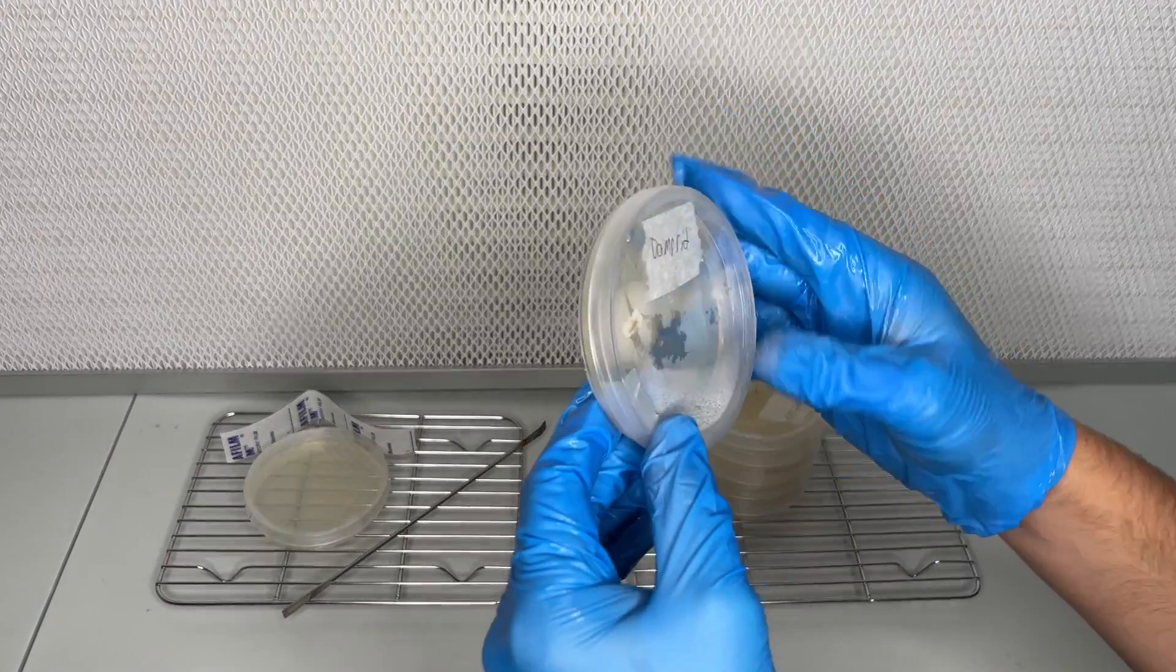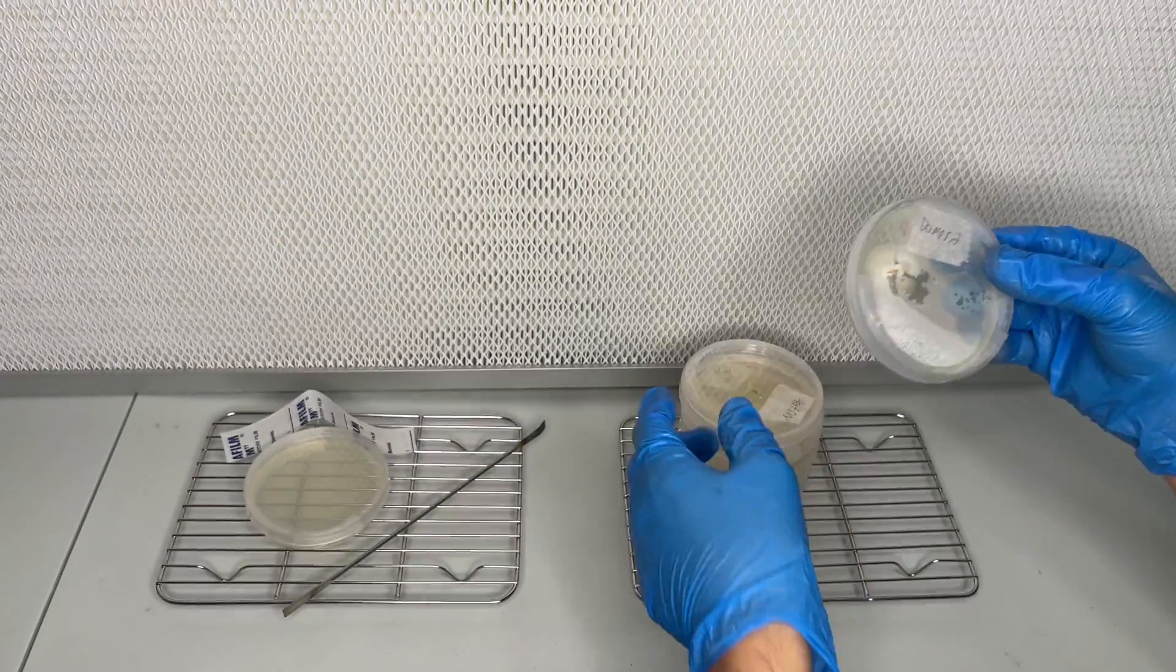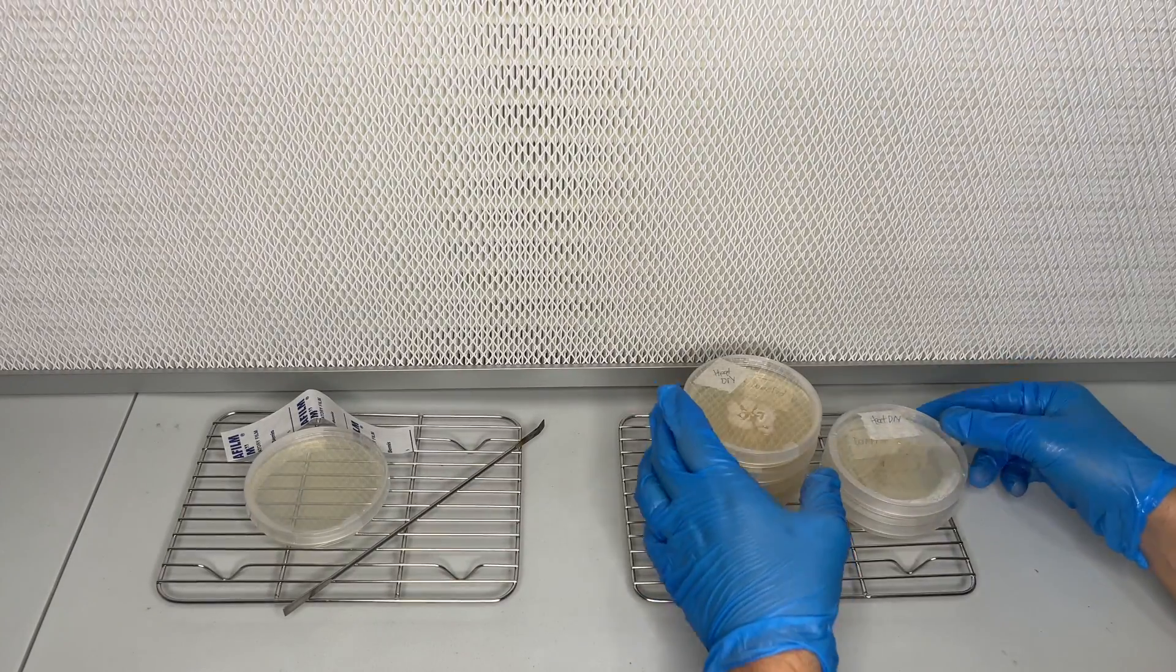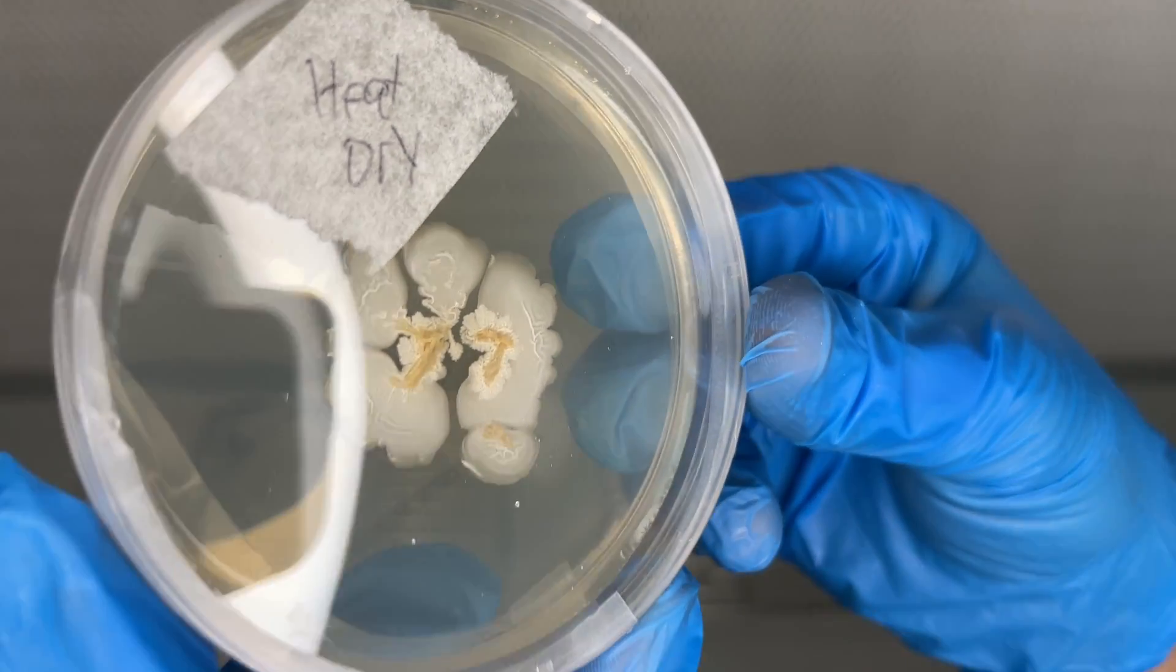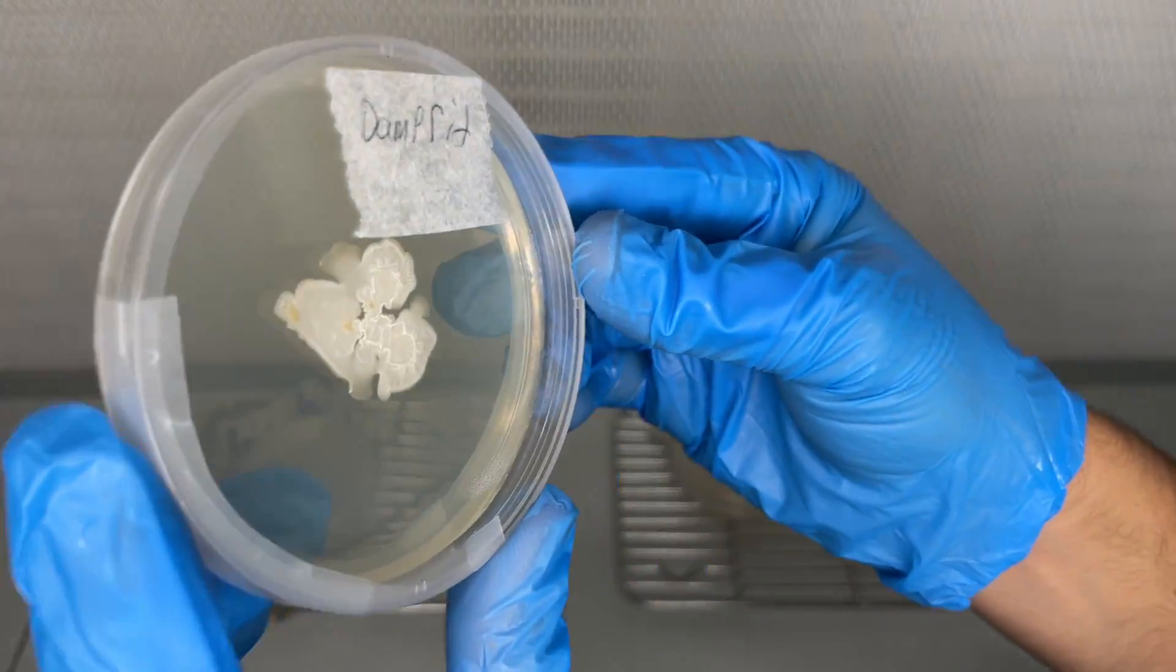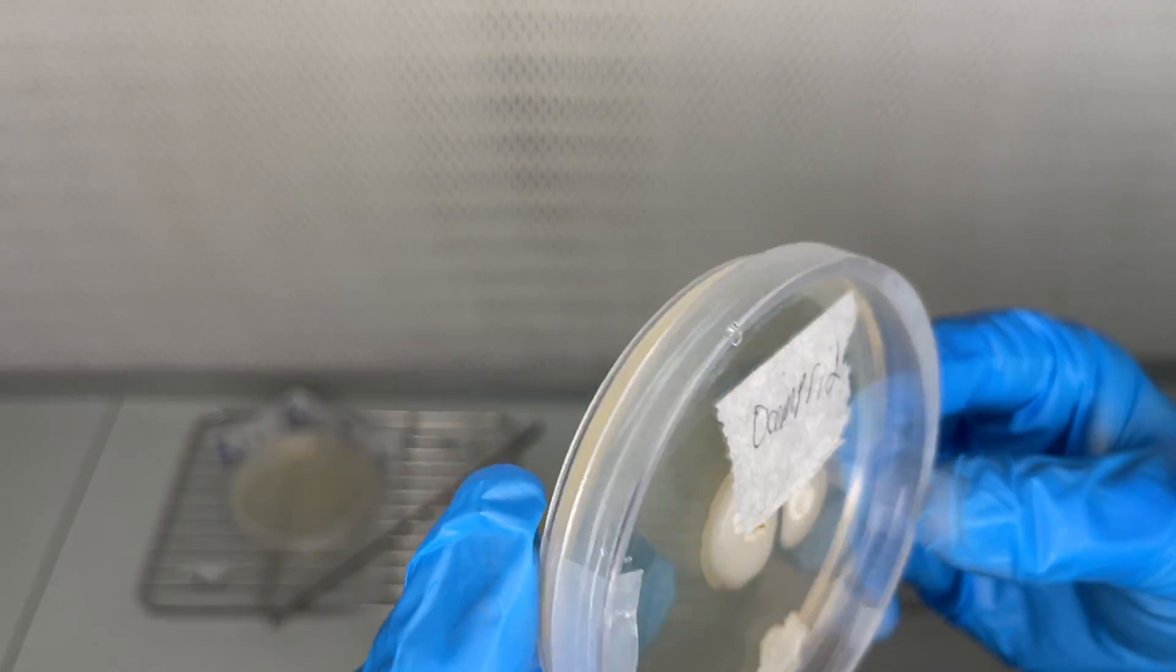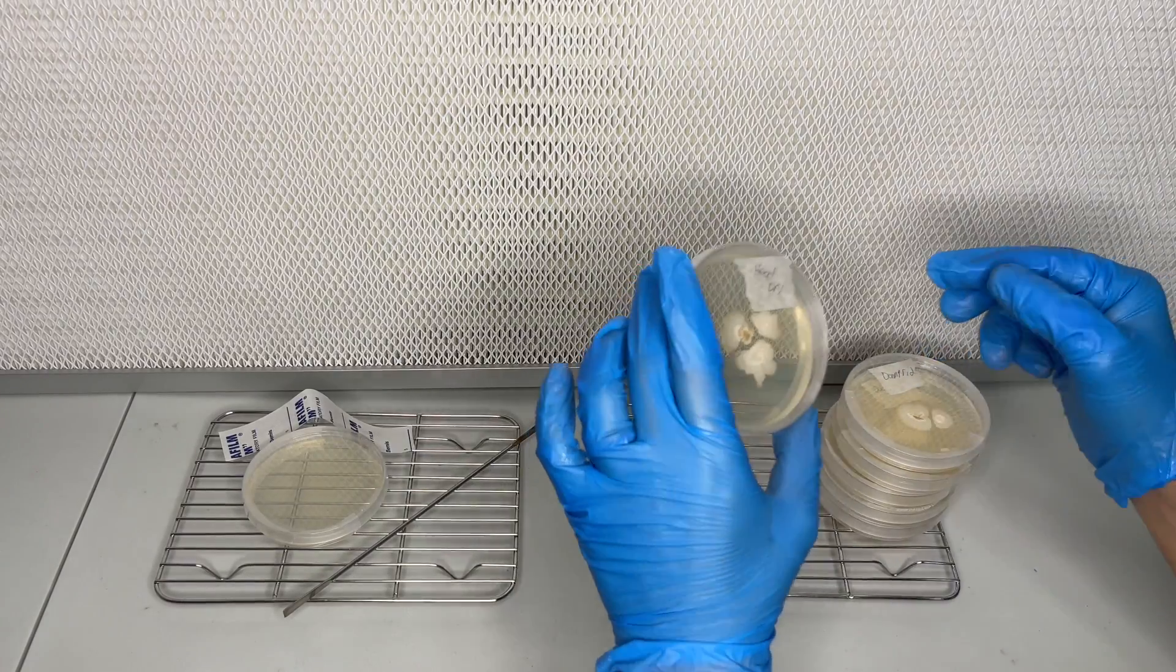After allowing the agar plates to incubate at 75 degrees Fahrenheit for two weeks the results were in. None of the heat dry agar plates were successful, one of them showing no growth at all and the others showing really bad bacterial growth. Out of the dampred batch they all had bacteria but one of the plates had a tiny piece of actual mycelium growing. So in the next part I go ahead and transfer away from the bacteria to a new plate to try to isolate the mycelium.